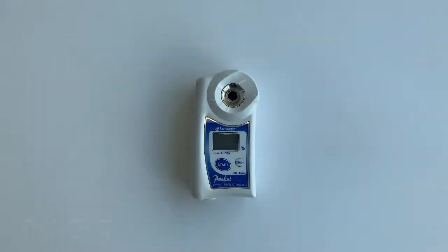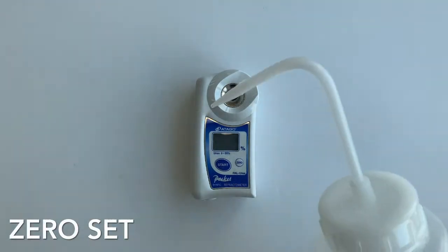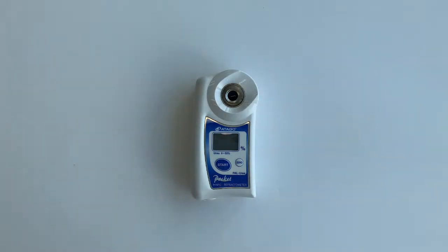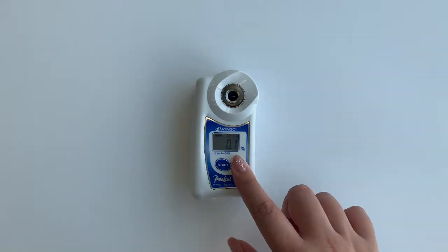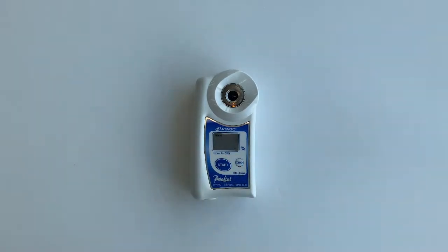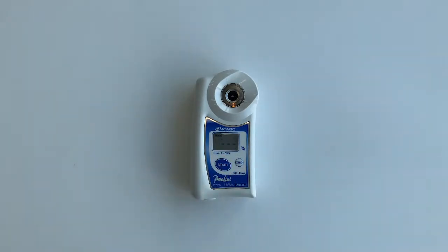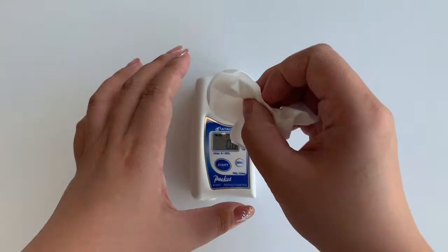So let me start with measuring PAL-urea. What you want to do first is make sure to zero set using water. After pressing start, press 0 for zero set. And after it shows 0, press start again to make sure that it shows 0.